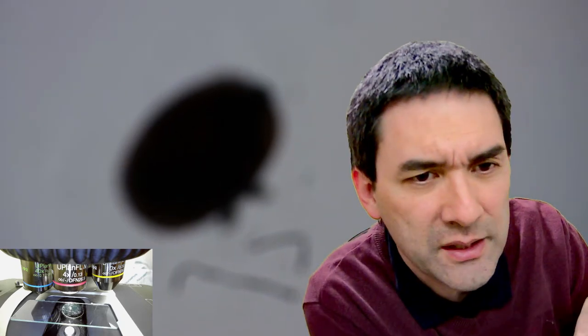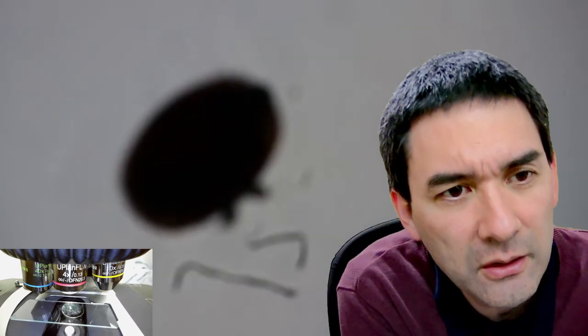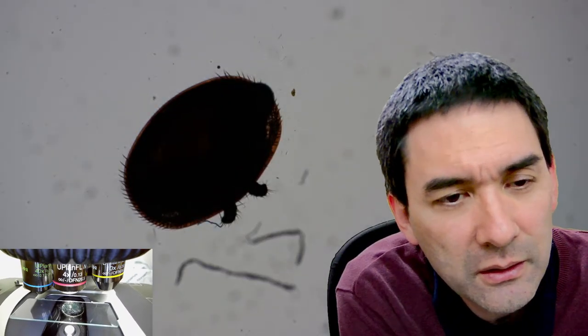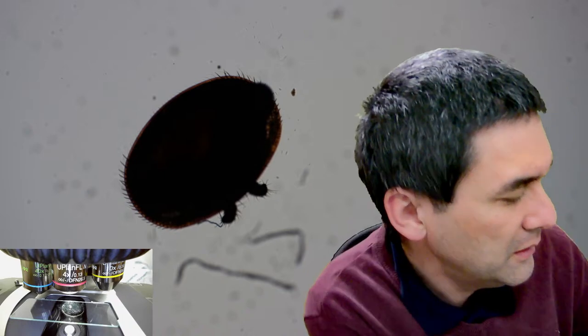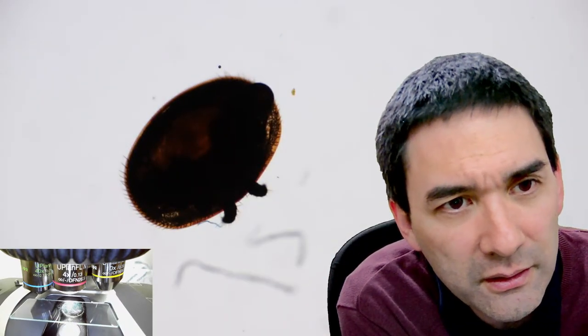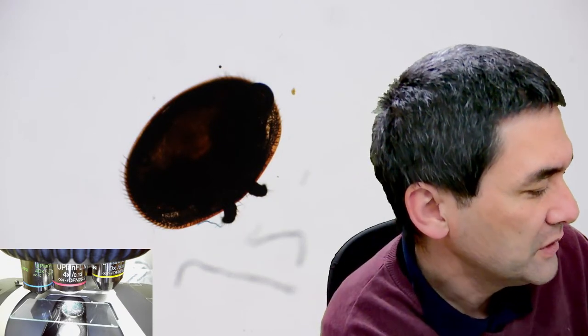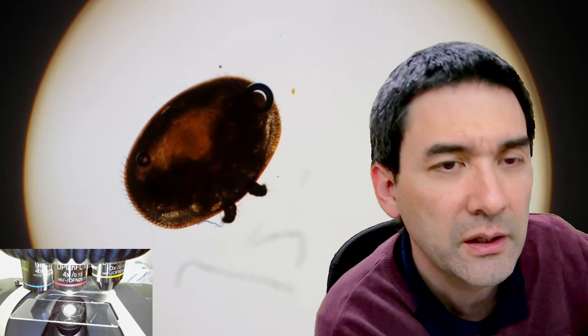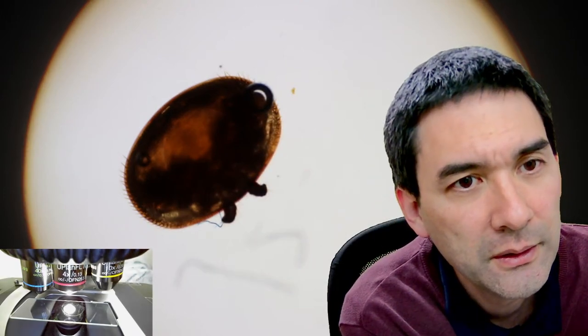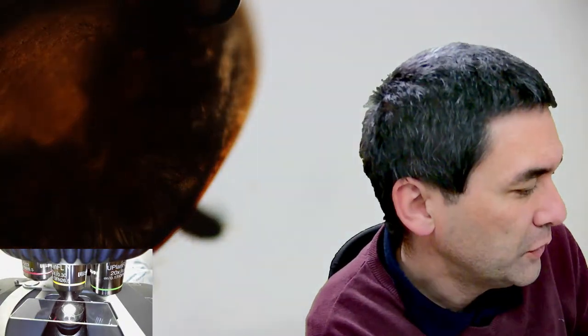Unfortunately, I think I have some dust in here. I think I might have some dust in here as well. It's very dark. You see that? It's actually a very dark specimen. Now it's a little bit better. There seems to be an air bubble coming out. Maybe I have to open the condenser a little bit more.